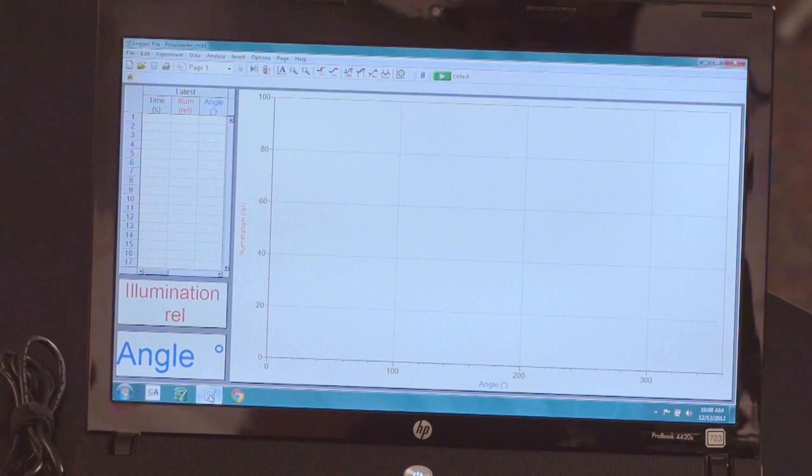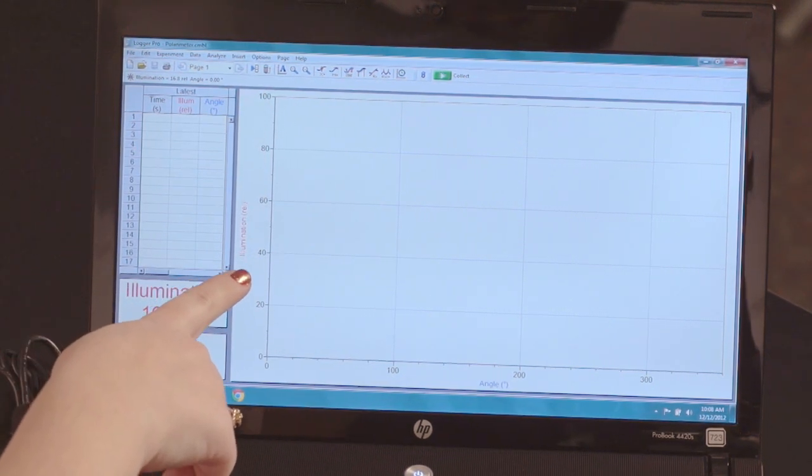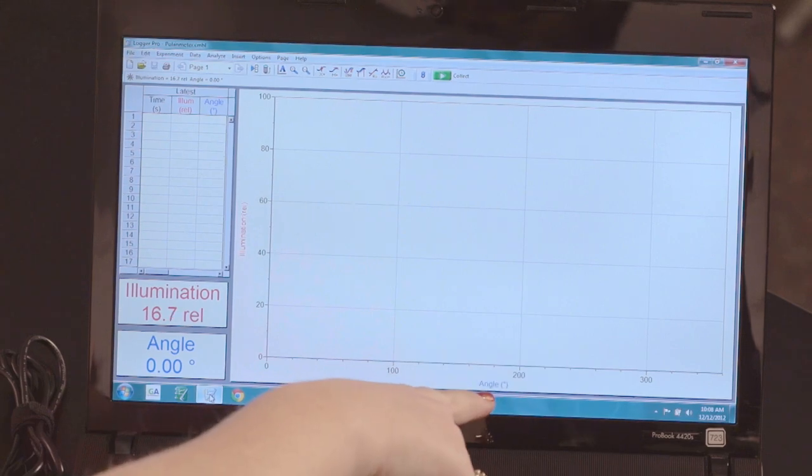Make sure you note the axes on the graph. The Y axis should be illumination and the X axis should be angle.